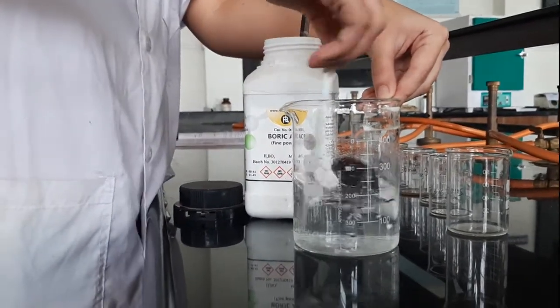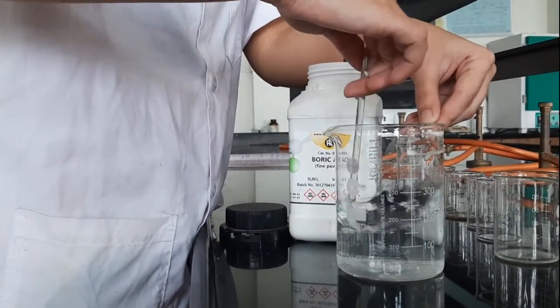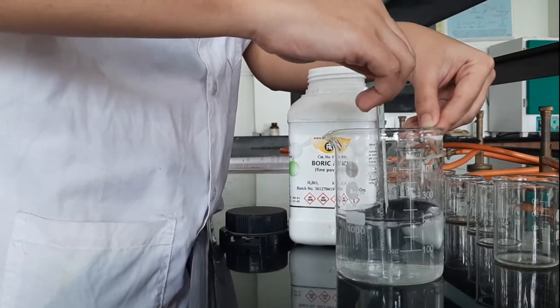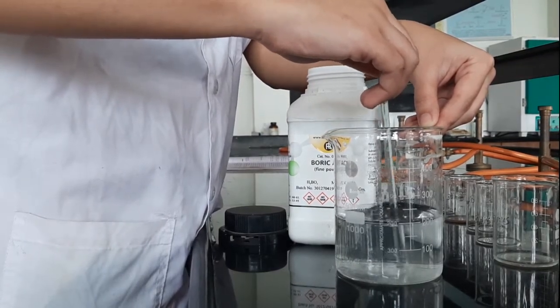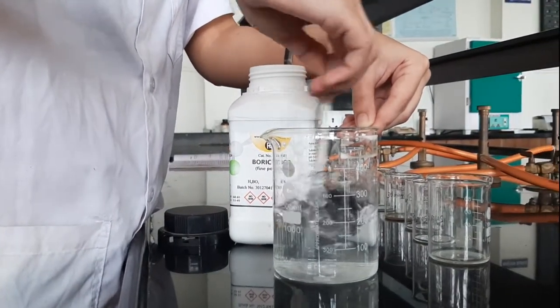See, now the boric acid has dissolved. Only small lumps are remaining, but those will also get dissolved. So our supersaturated solution is not formed yet. We might need to add a further small amount of boric acid.